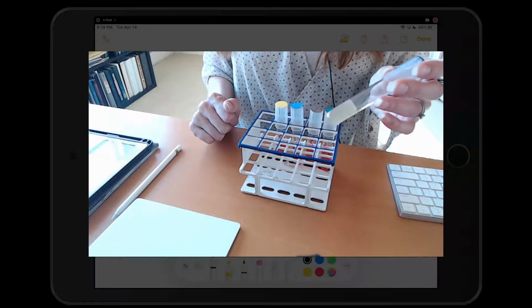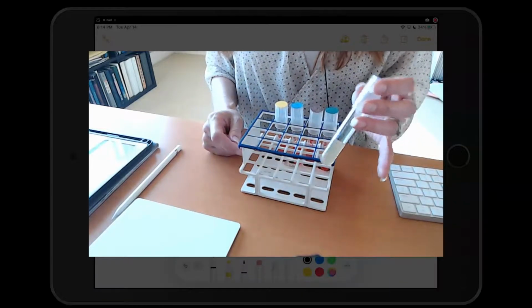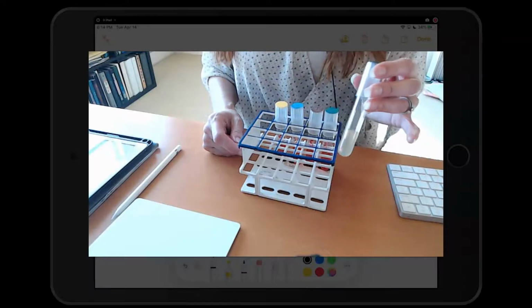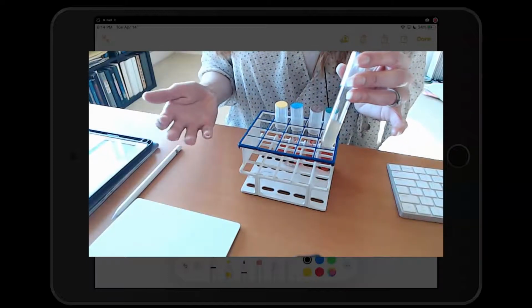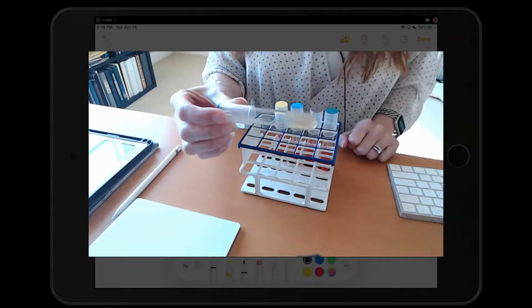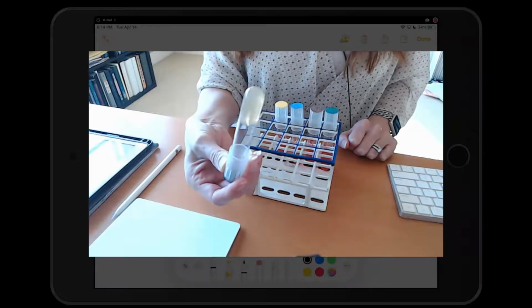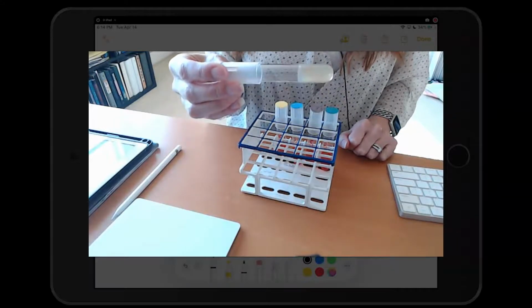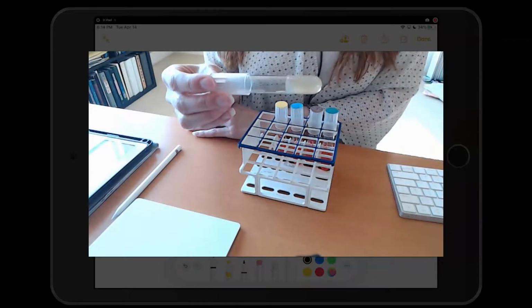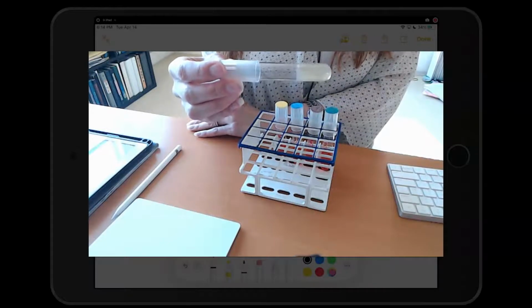and break down gelatin, which is a protein. It breaks it down to its monomeric units, which would be amino acids, and that way it's easier for consumption. One thing that I want you to notice about this gelatin tube is that it is solid. See, I can put it upside down, I put it sideways, and it is solid. Okay? What do you think will happen to this gelatin if the bacteria produces an enzyme that breaks it down? Do you think it's still going to be solid? No, probably not, right? It would break it down.